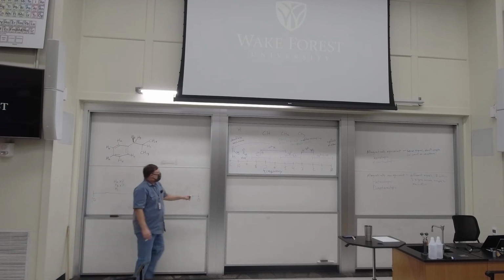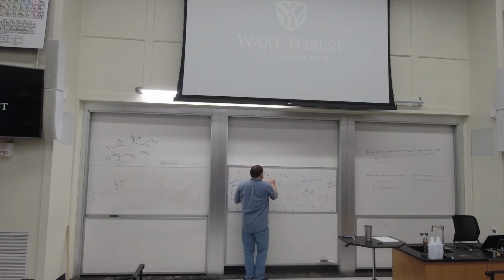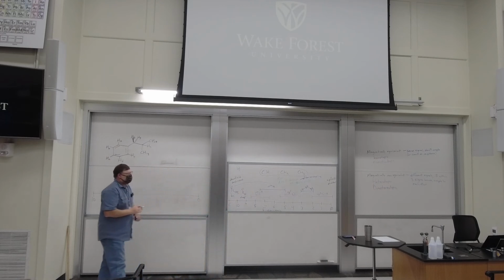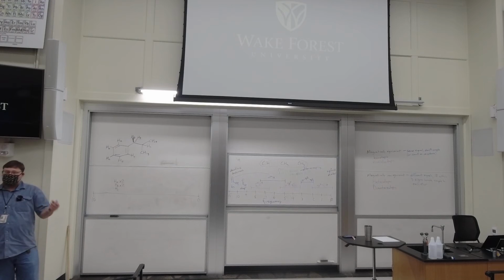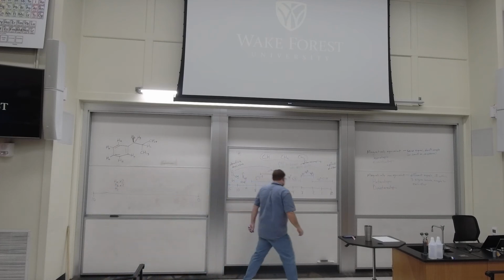Oh, the other thing over here I put up that may not be obviously clear, in these regions, so this is talking more about the sp3 carbons, a CH will be downfield of a CH2, will be downfield of a CH3, all things being equal. Make sure all things are equal.